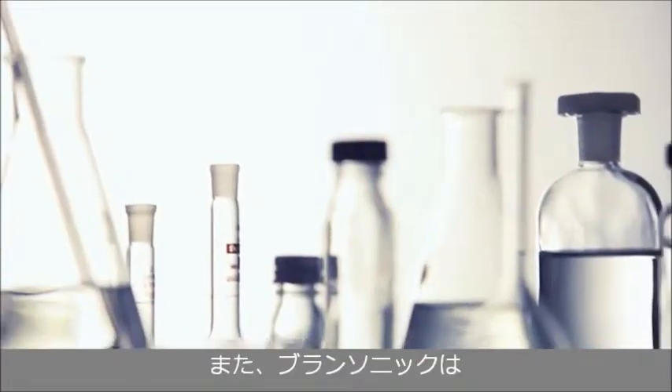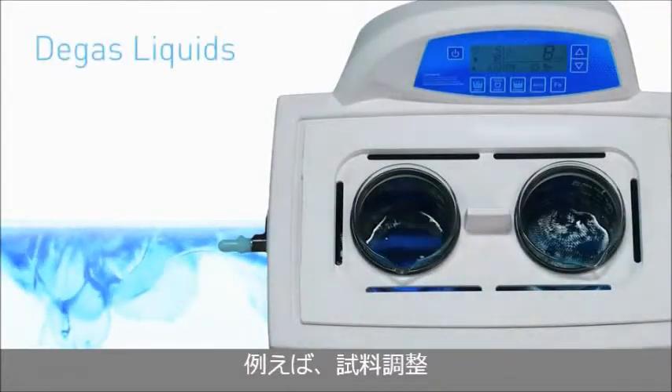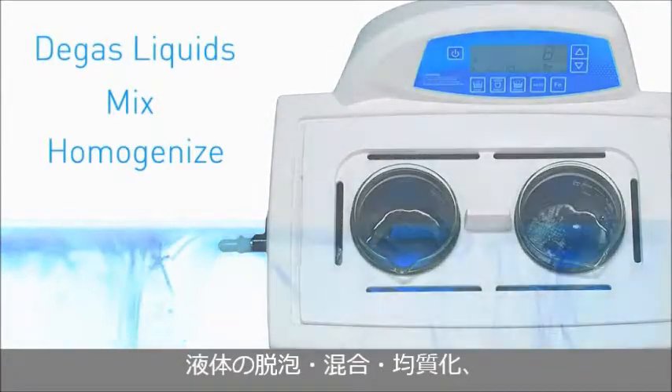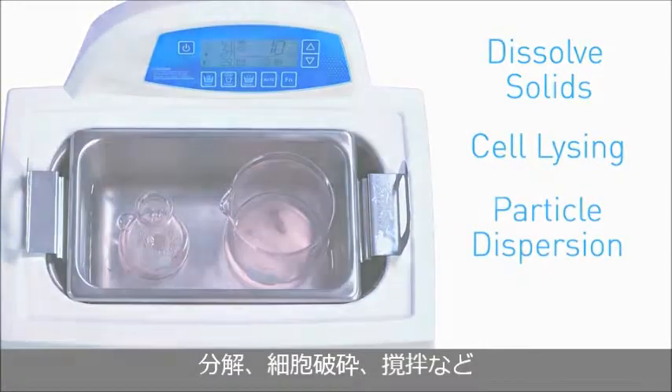At Branson, we're more than ultrasonic baths. We're going beyond cleaning, like sample preparation, which includes degassing liquids, mixing and homogenization, dissolving solids, cell lysing, and dispersion of particles.